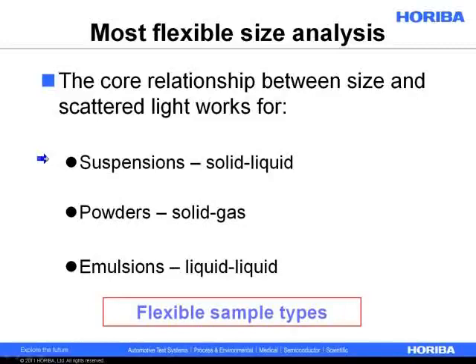Diffraction is also flexible in the sense that it can measure many different types of materials. It can measure suspensions, which are solid-liquid, powders, which are solid-gas, or emulsions, which are liquid-liquid. So it really covers a wide gamut. It can, in fact, also measure creams and pastes using the right accessories as well.